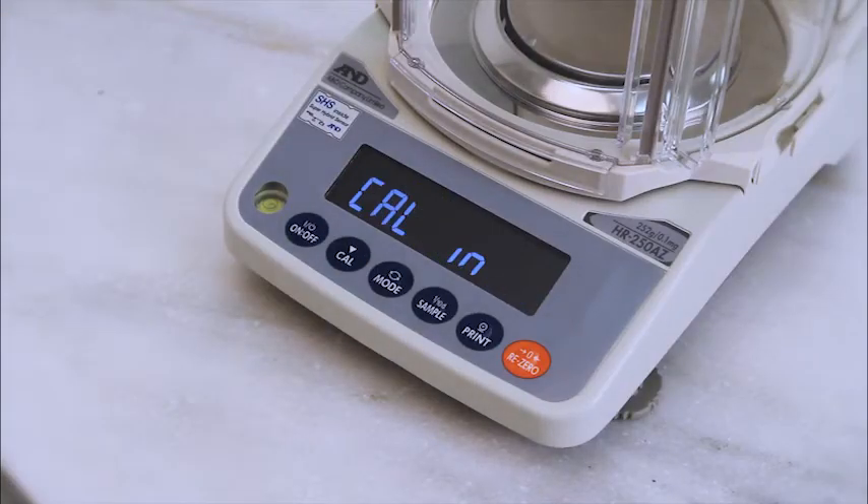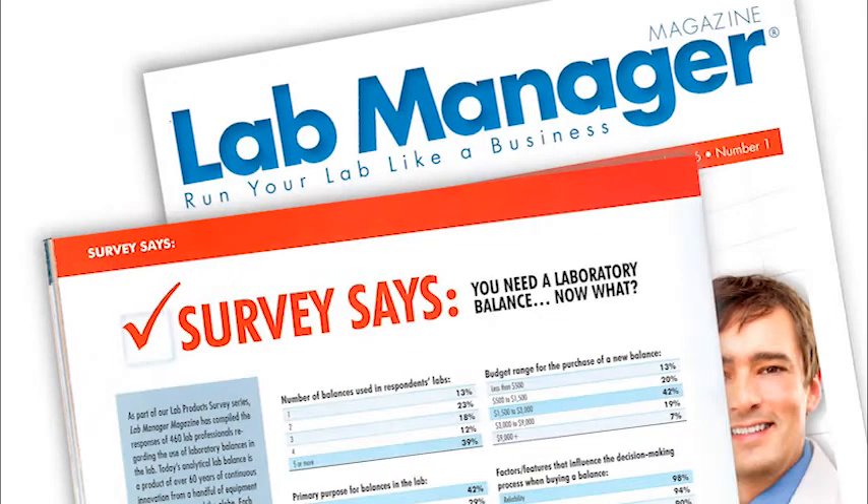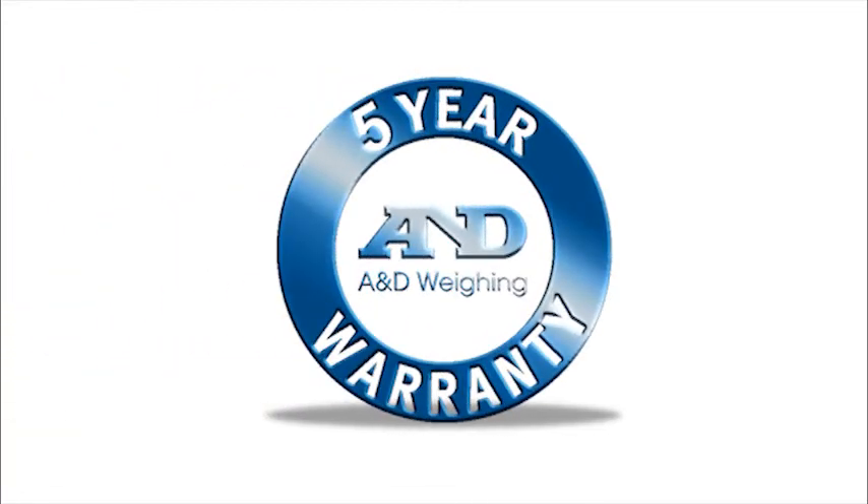The HRA-Z also saves time with built-in calibration. In a recent lab manager survey, reliability was the number one consideration cited by 98% of respondents. So you'll be glad to learn that A&D backs the HRA with the longest warranty in the industry — five years.